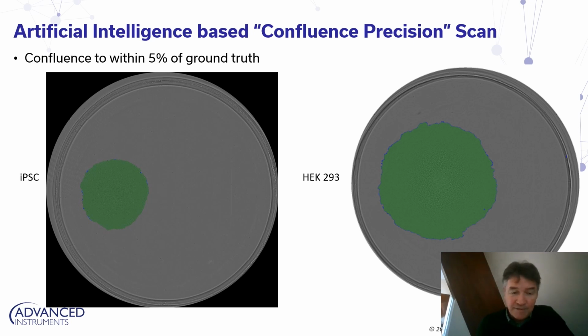In the case of the iPSC colony, this allows us to very accurately gauge the optimum time point for expansion, without any risk of loss of pluripotency or other negative factors when deciding when to expand.